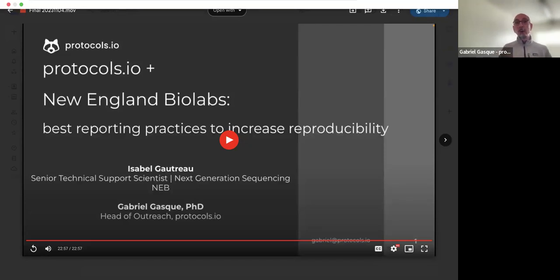If you decide to go ahead and publish that new fork, the new fork will receive an independent DOI, but in that public protocol, there will be a link to the original protocol as well, and an indication that the protocol that you published was forked from an already public protocol.